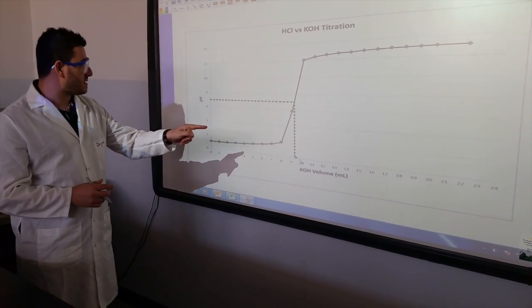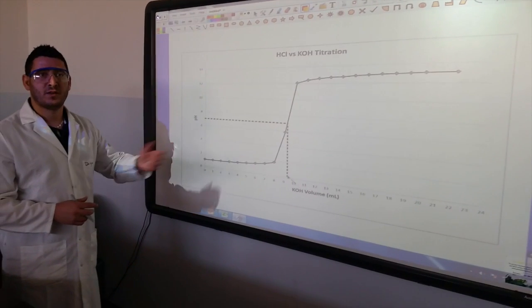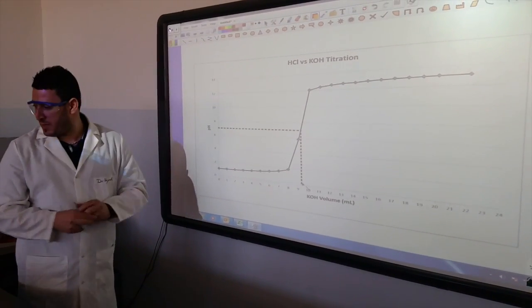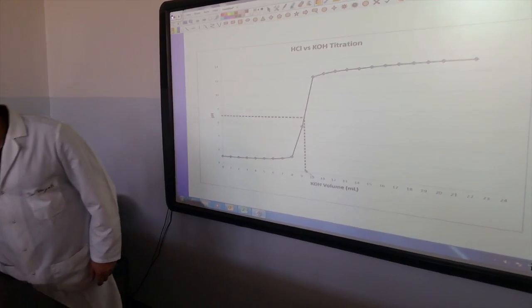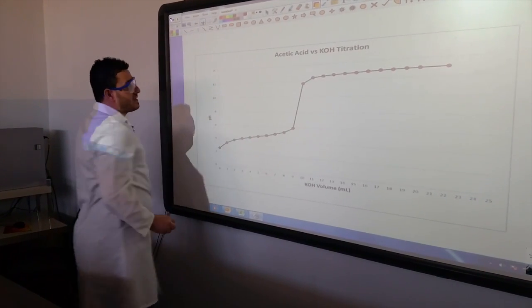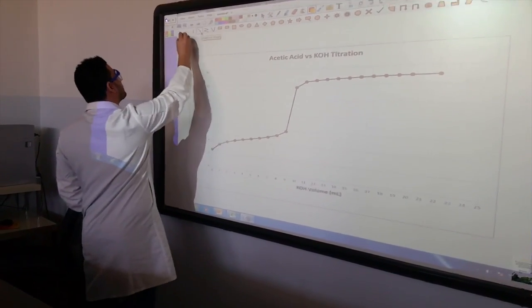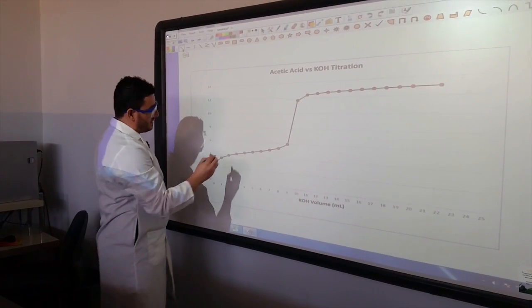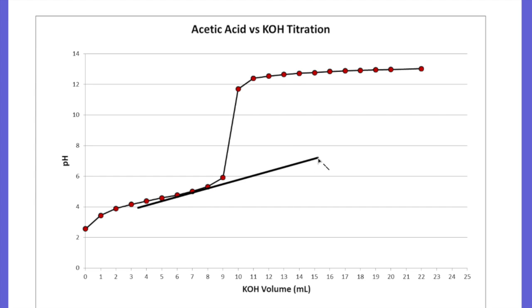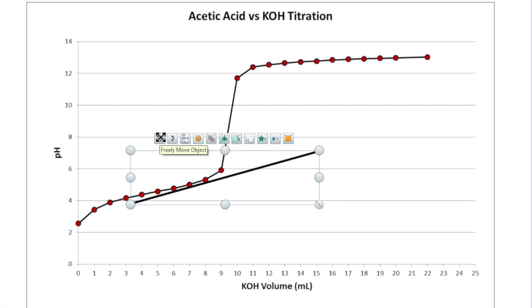This volume, which is the equivalence point volume, you will use it to determine the concentration of the acid, knowing the concentration of the base, as you can see it here, 0.102. Now for the weak acid, it's different. Because what you have to do, you have to take a tangent to the bottom part of the titration curve. So you take a tangent to it, something like that, okay?